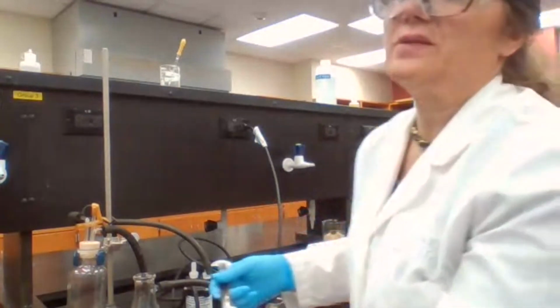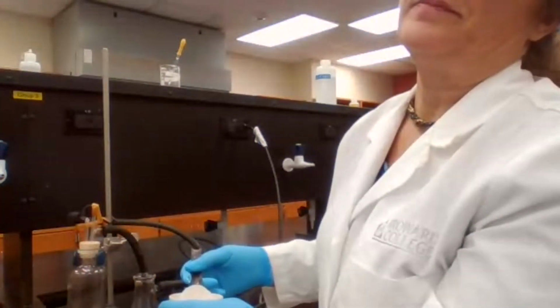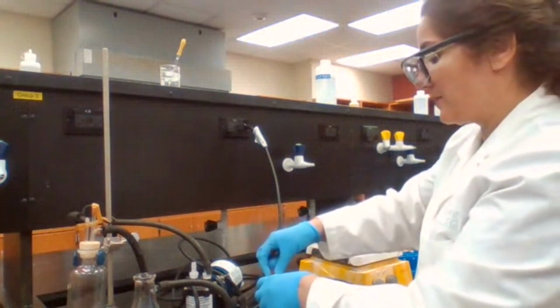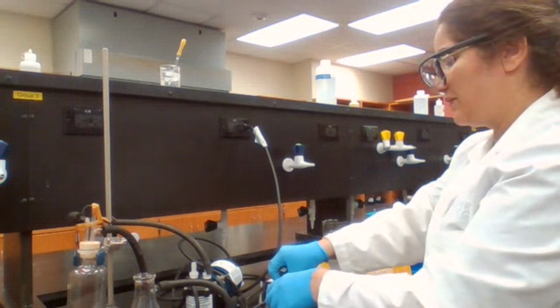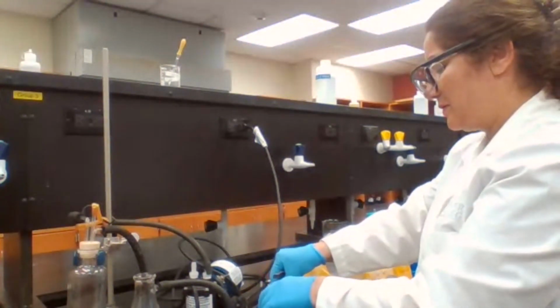What is the suggested volume for methanol? Suggested volume, just the minimum amount, as much as it would help to dissolve the sample.